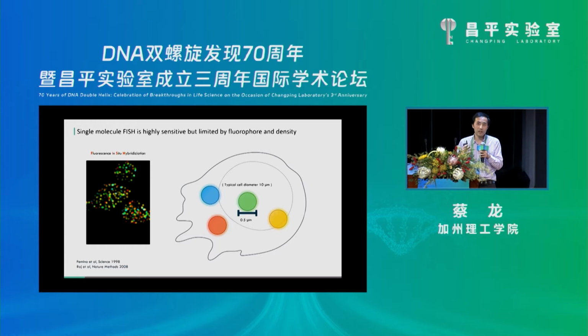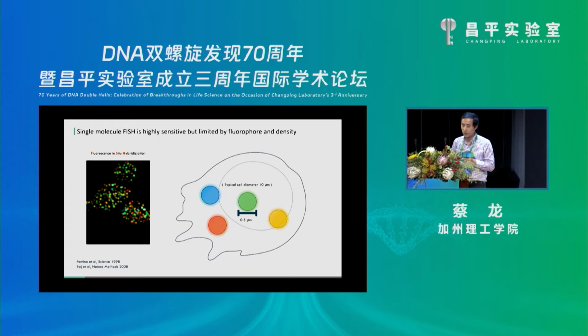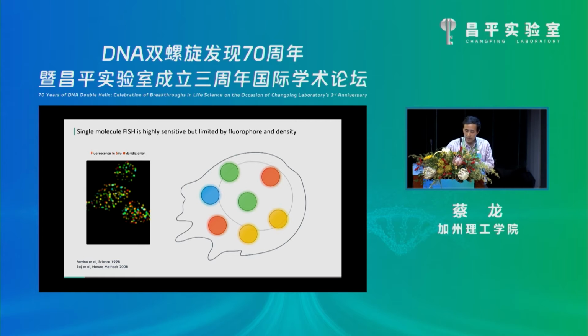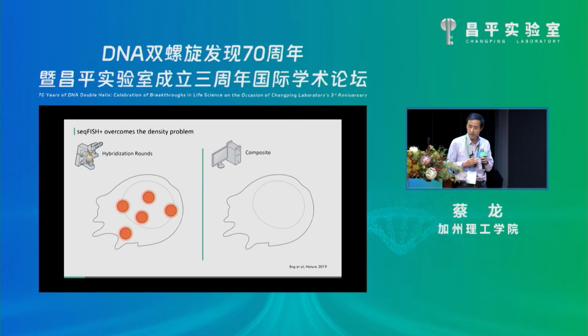But it turned out that, at the time, the super resolution methods that had been developed use stochastic blinking methods that require a single dye molecule to switch. And that's very hard to detect single dye molecules in tissues. So it turns out the sequential rounds of hybridization, the SeqFISH method, gives us a way to perform super resolution microscopy. Right? Think about it this way.